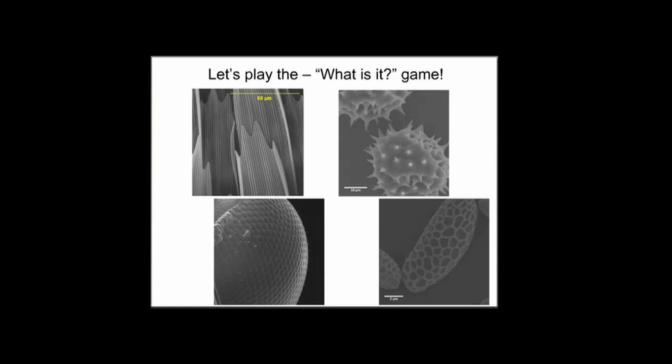Okay, I'll go ahead and answer it. And so, yes, it is more pollen. It is a different kind of pollen, and so that also gives you a sense of the variety of pollen. I'll also ask what type of pollen it is, but it is pollen that comes from a lily. So it gives you this nice idea of how things can vary so differently, and why some things maybe grow differently, affect people differently, and things like that.